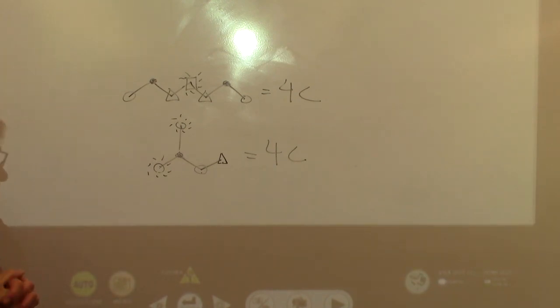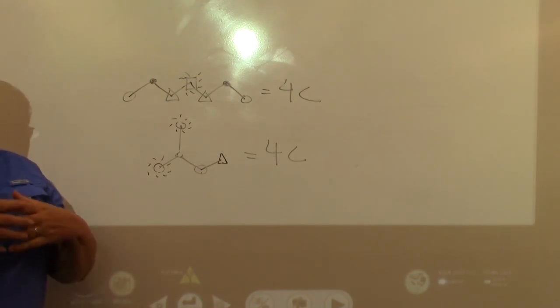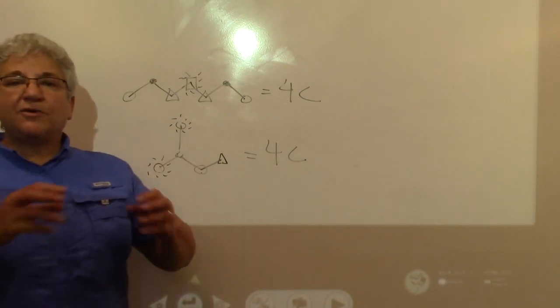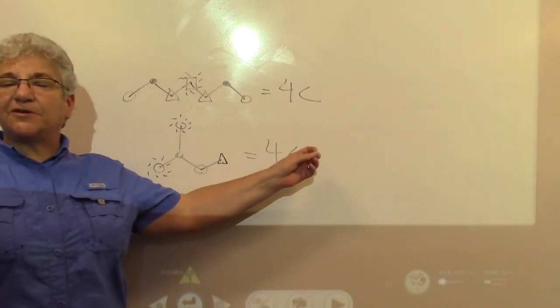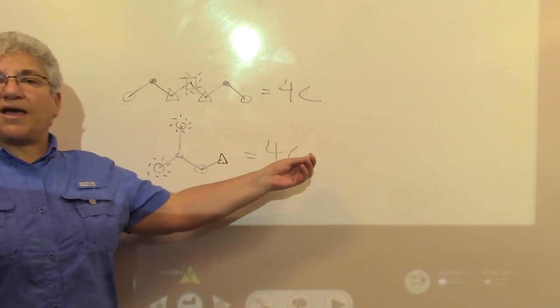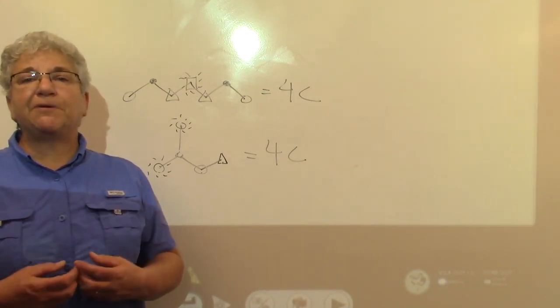And thus far, you've only had to go 1 carbon and then they're the same, right? You can go more than 1 carbon. When you're trying to determine if 2 carbons are different from each other, you have to follow the whole molecule out. And if you don't find any difference when you follow the whole molecule, then they are in fact the same. But if you find a difference 8 carbons away, then that means that they are different from each other and they will have a different resonance, and therefore you'll see a peak for them.